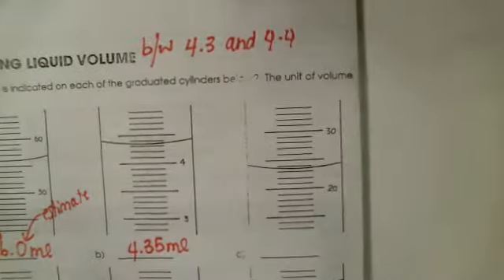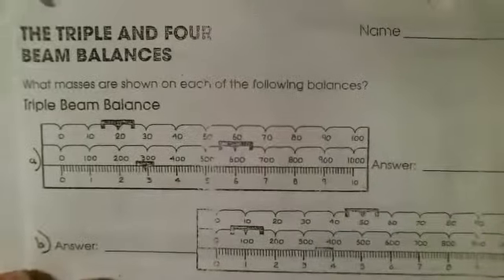All right. I want you guys to complete this side of the worksheet. And when you're done, move on to the triple beam and 4 beam balances.